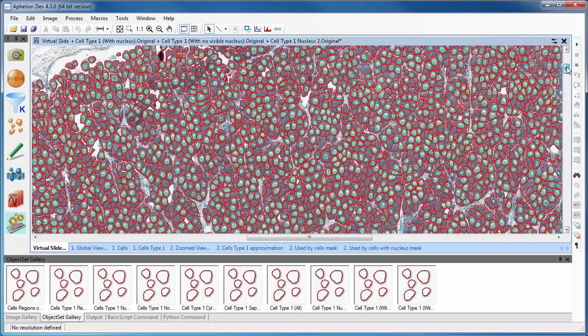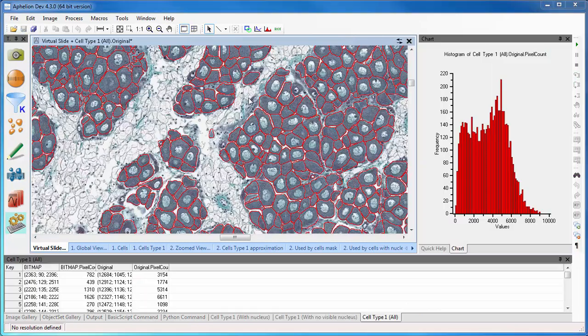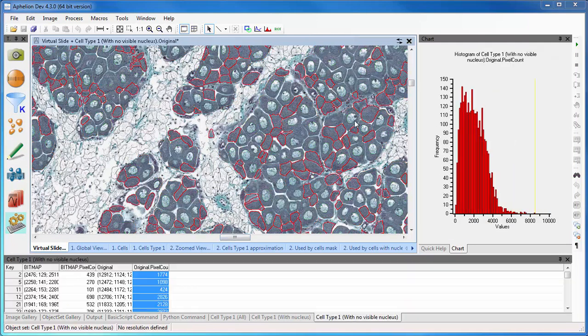The measurements can now be easily displayed as a histogram for cell area for all of the measured cells, just the measured cells with nuclei, or just the measured cells without nuclei.